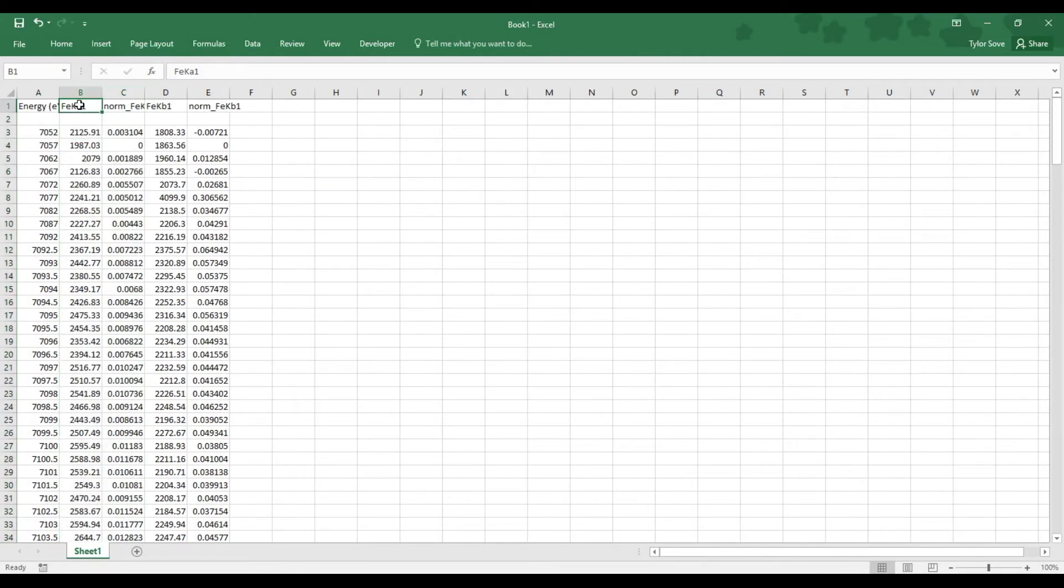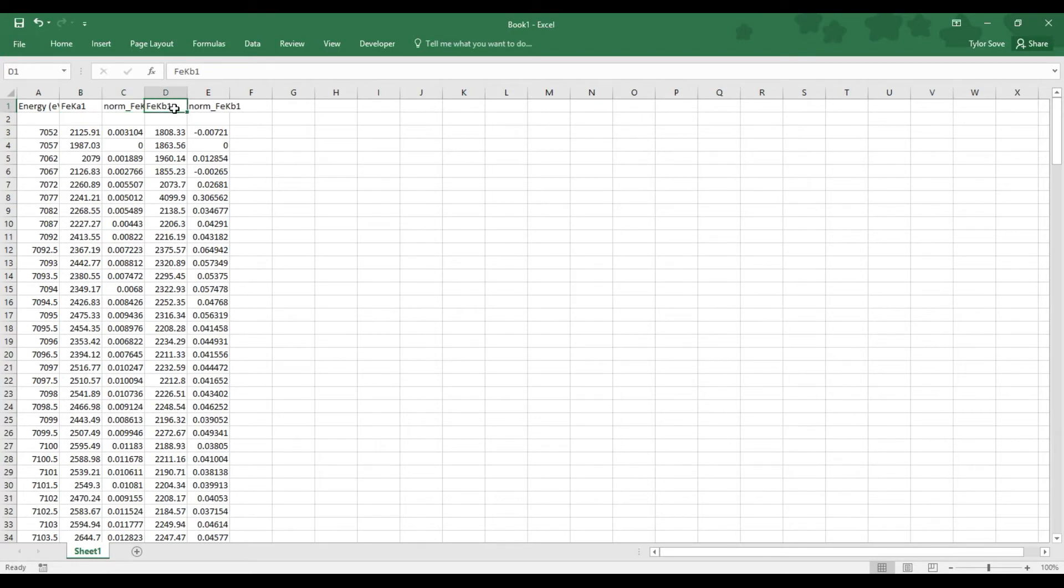Now what we're left with are the Fluorescent Mode XANES. And for this example, I have Iron K-alpha, Normalized Iron K-alpha, Iron K-beta, and Normalized Iron K-beta.